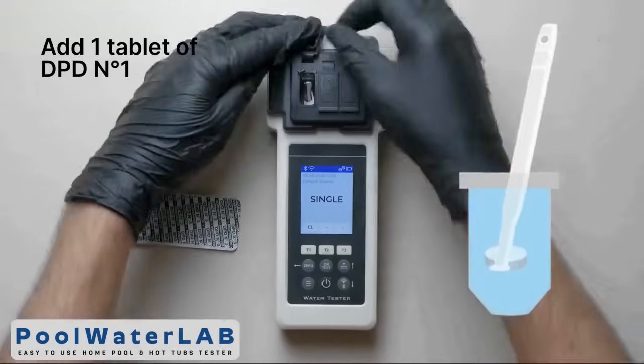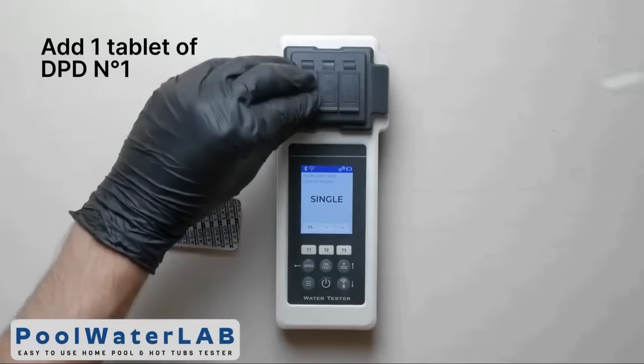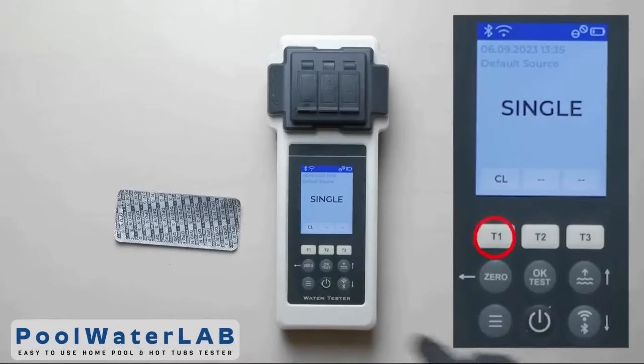Add the tablet of DPT number 1 directly into the chamber. Crush and stir the tablet, then cover the measuring chamber with a light protection cap.